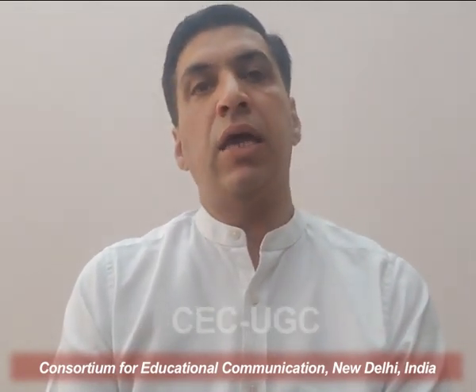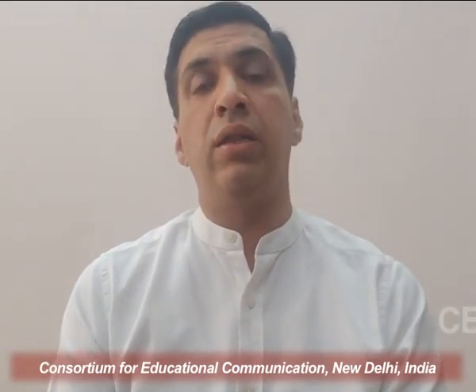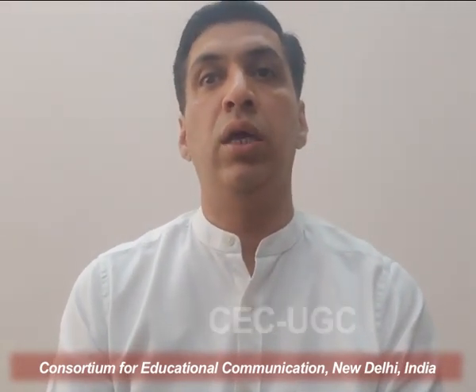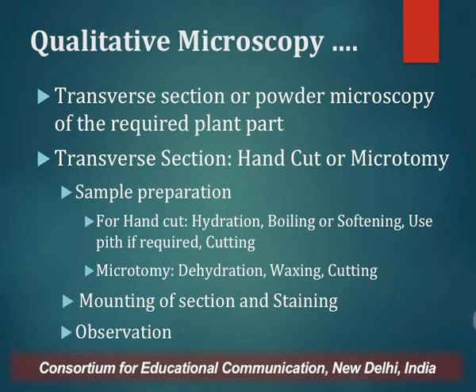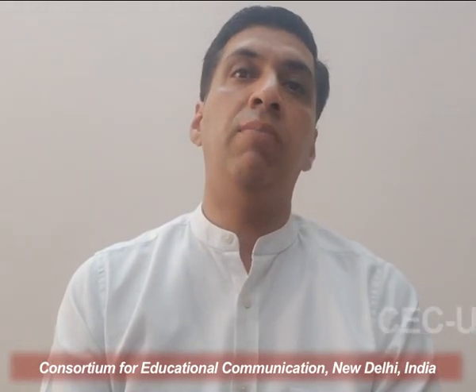Whereas if we are getting the sample in the dried form, we all know that drying is done by evaporating the moisture, and once the moisture is evaporated from the sample, all the cells or the tissues get shrunk. So the first step of the sample preparation when you get a dry sample is to hydrate that sample. And now the hydration is done either by dipping the plant part or the required sample in distilled water for a sufficient period of time.